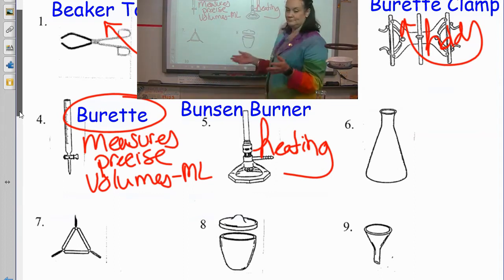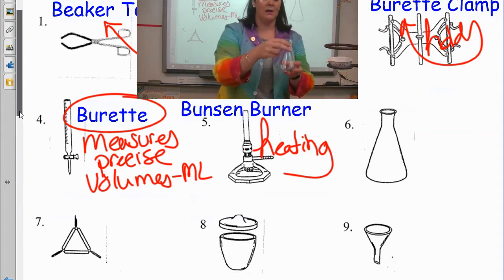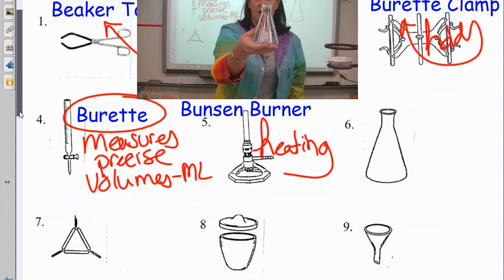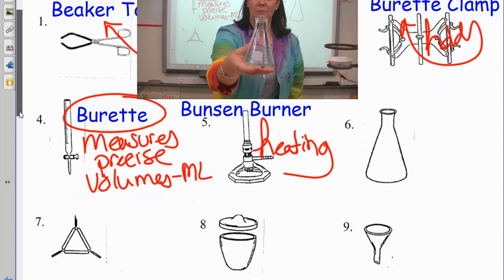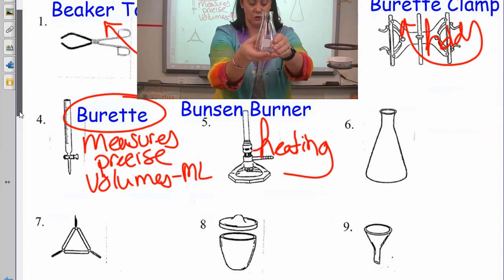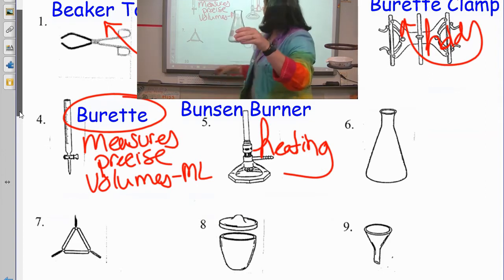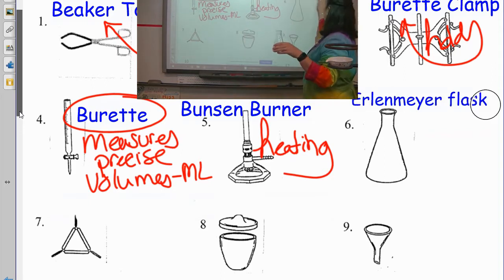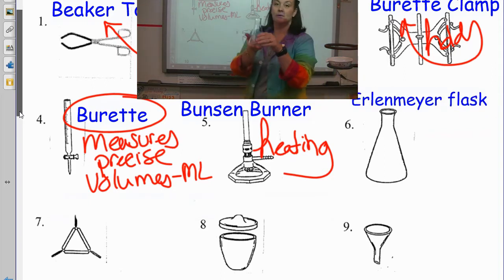What do we have next? Next we have, again, a classic. This is called an Erlenmeyer flask. Sometimes people want to call it a beaker, things like that. You can tell by the concave shape, but again, this is an Erlenmeyer flask. I'll put it up here because it's hard to spell. Erlenmeyer flask. When you design something or when you discover something, you can name it after yourself. So maybe a bay flask, I don't know. But so we have the Erlenmeyer.